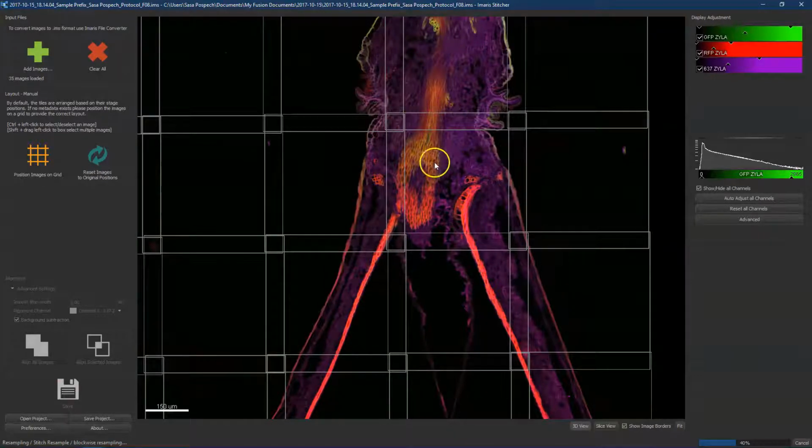So the common approach, and the one I use the most, is the weighted mean. That is, the intensity used between 2 neighboring tiles is proportional to the pixel's proximity to each neighboring tile. So this gives good results in most cases. Now, the alternative is sample closest, which is simply that the intensity used between the 2 neighboring tiles is exactly the intensity present in the closest neighboring tile. And this can be useful for some images that suffer from optical aberrations, where maybe the weighted mean gives you a less visually pleasing result.